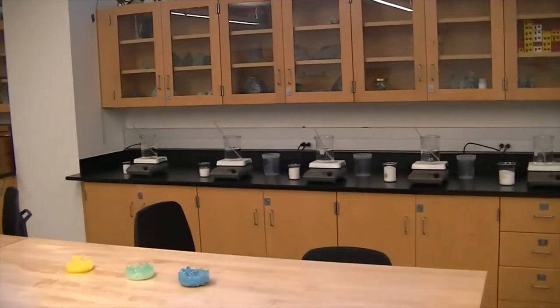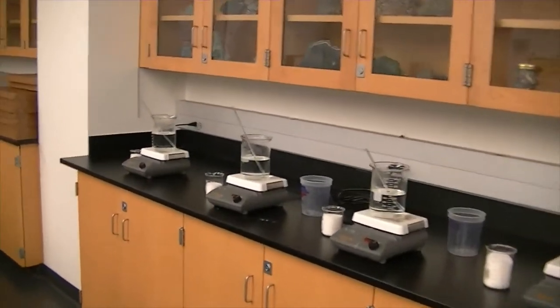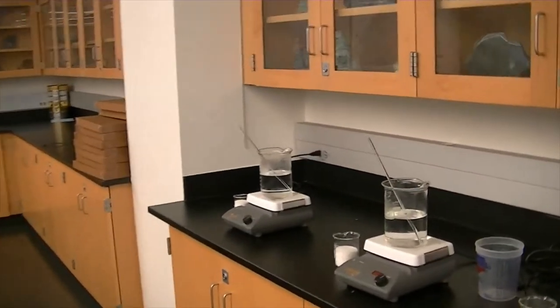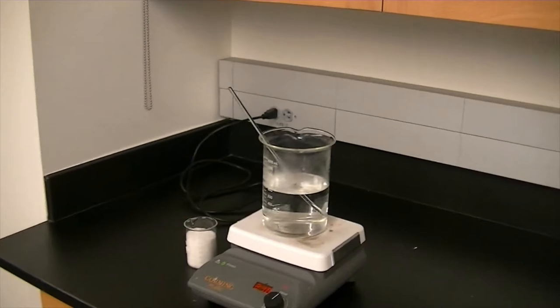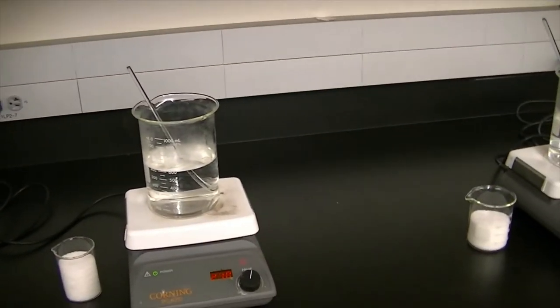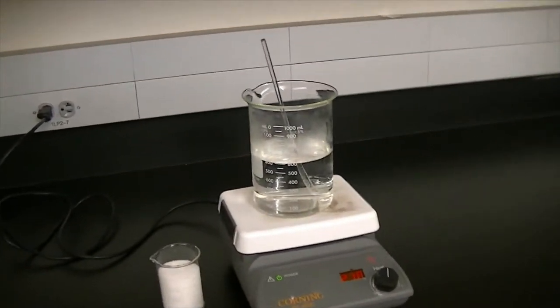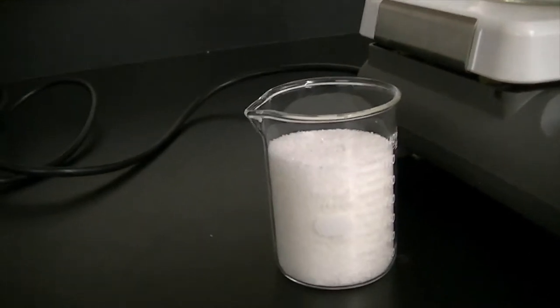And hopefully when they lift restrictions we can come and actually work in this lab. So here are the 10 stations. I'm assigning you, just randomly picking people together, and this is going to be your station number one, and so forth, station number two all the way to number 10. So here's the salt. It's a white salt, basically ammonium phosphate.